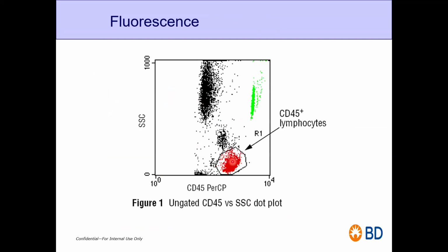This is again an example of your fluorochrome, and basically fluorochrome binding, or your binding sites. They have used the antibody CD45. These are your lymphocytes, monocytes, and neutrophils. As you see, in your lymphocytes you have many more binding sites for CD45. That's why the fluorescence intensity is high in lymphocytes compared to your monocytes and your neutrophils.